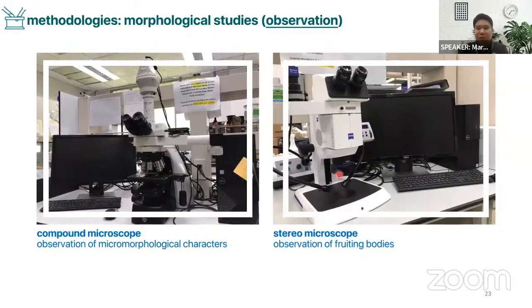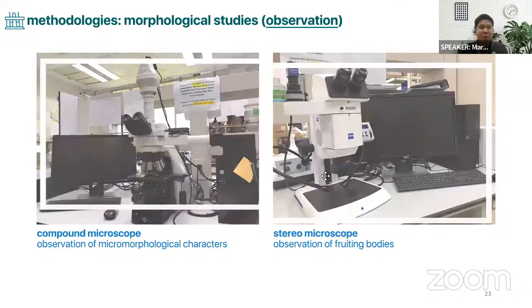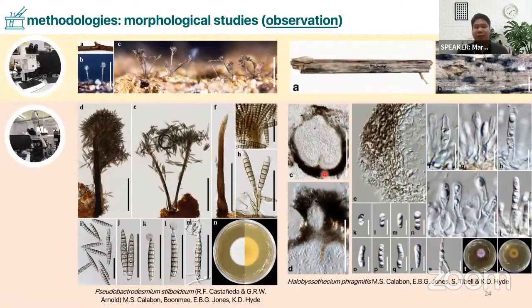After the cutting, we observe under the microscope, and these are the morphologies. It's quite interesting, right? Here is the hyphomycete. You can see the conidiophore. It's like a small forest on a very small wood twig, and you can see the morphology of the conidia. This is the conidia, the spore. Long time ago, we just saw spores as globose or circular, but in the natural habitat, they have different morphology.